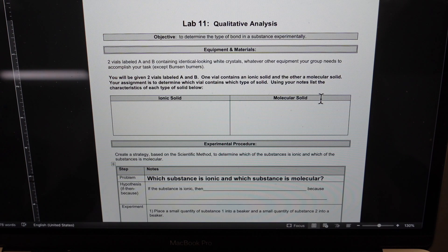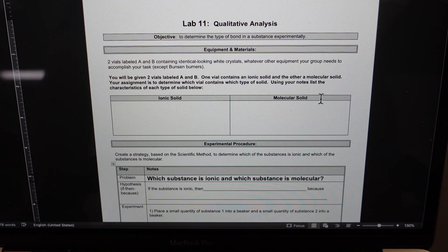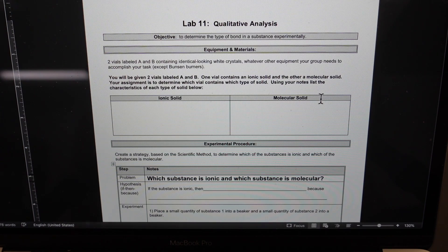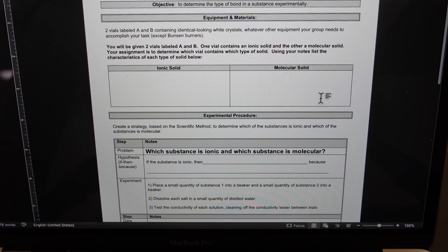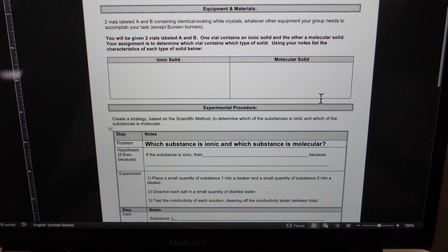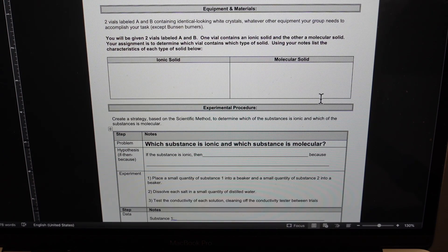So without tasting them, because that would not be safe, how could we figure out exactly which substance we have in each tube? So you will be given these vials and you'll have to determine which one contains sugar and which contains salt.